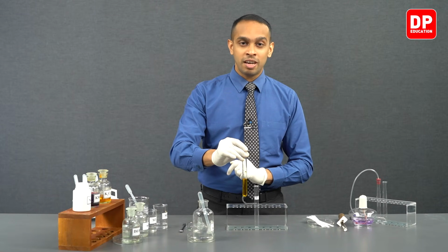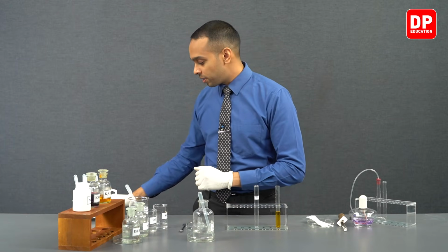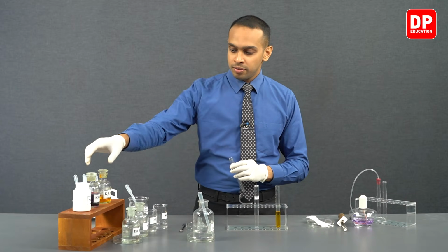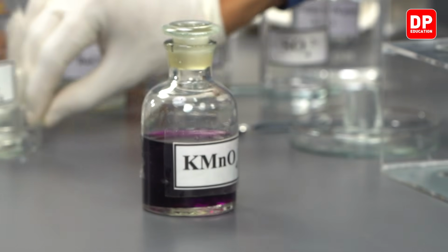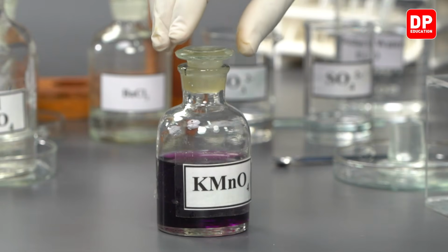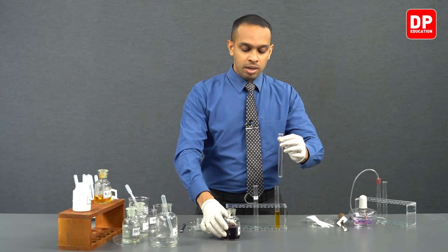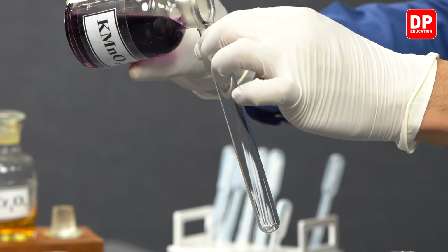Similarly, we will now move on to preparing our acidified potassium permanganate solution. In order to do that, we'll take another test tube, and we have our potassium permanganate solution here. You can observe that it is purple in color. Now let's take a small volume of potassium permanganate into our test tube.